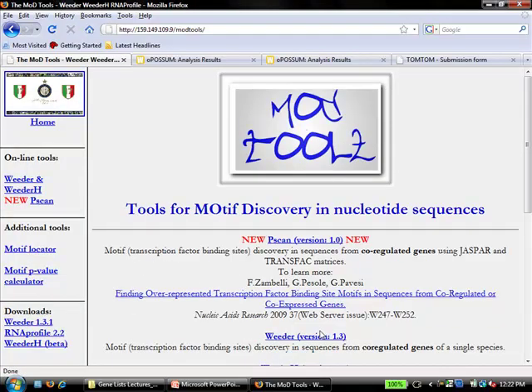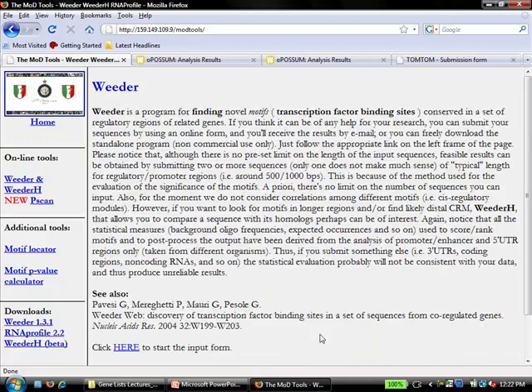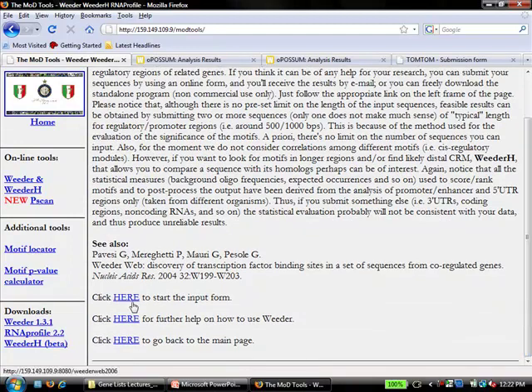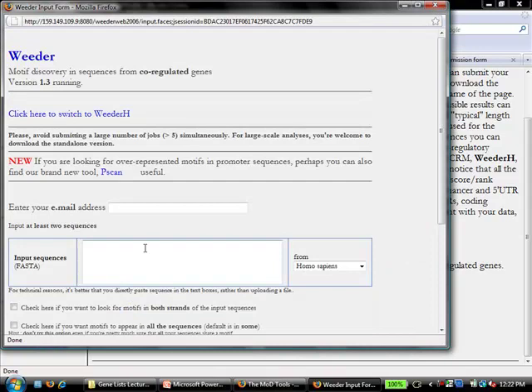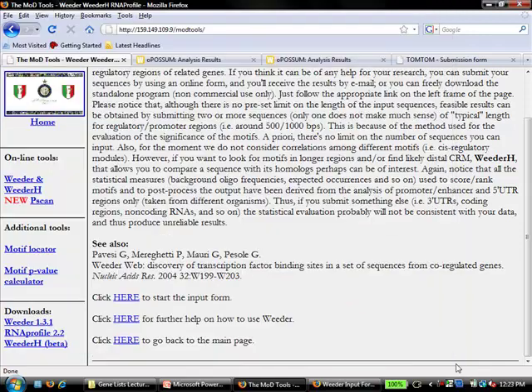For Weeder, you want version 1.3, which is midway down the page. Go to start inputting data — select FASTA sequences and choose a species, because Weeder is a string-based method and needs a pre-computed database of counts. Then let it run and it will send you an email. That's pretty much it for what I was trying to walk you through. I hope you're having some success with the promoter analysis, and I'll be available during the lunch break for questions.